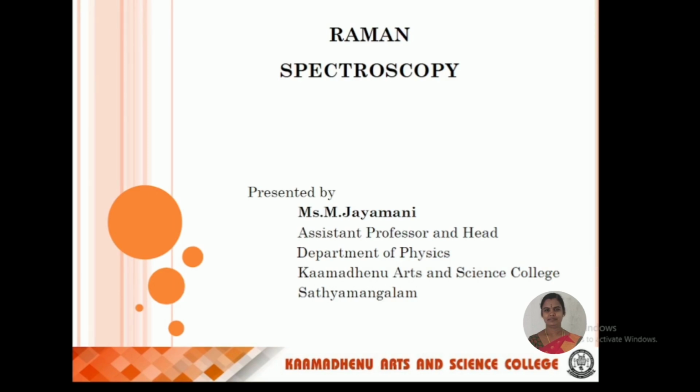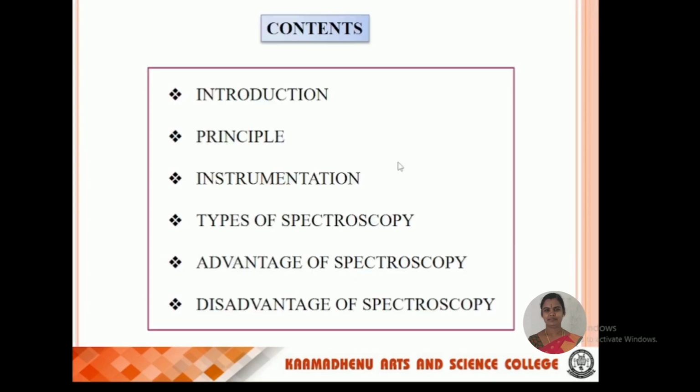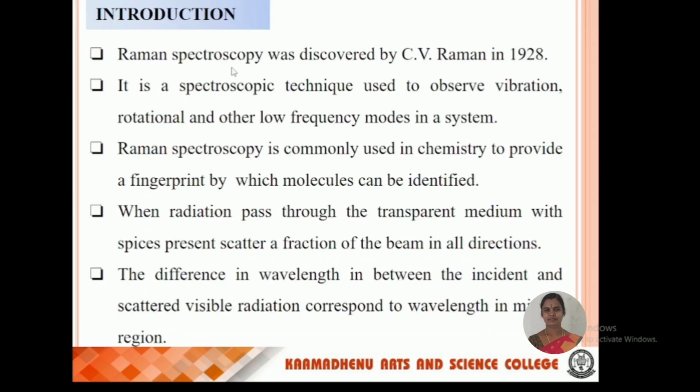Today we have to say about Raman spectroscopy. First we discuss the following points: introduction, then principle, then instrumentation. Next one is types of spectroscopy, then advantage of spectroscopy. The last one is disadvantage of spectroscopy. First we discuss about introduction of the spectroscopy.